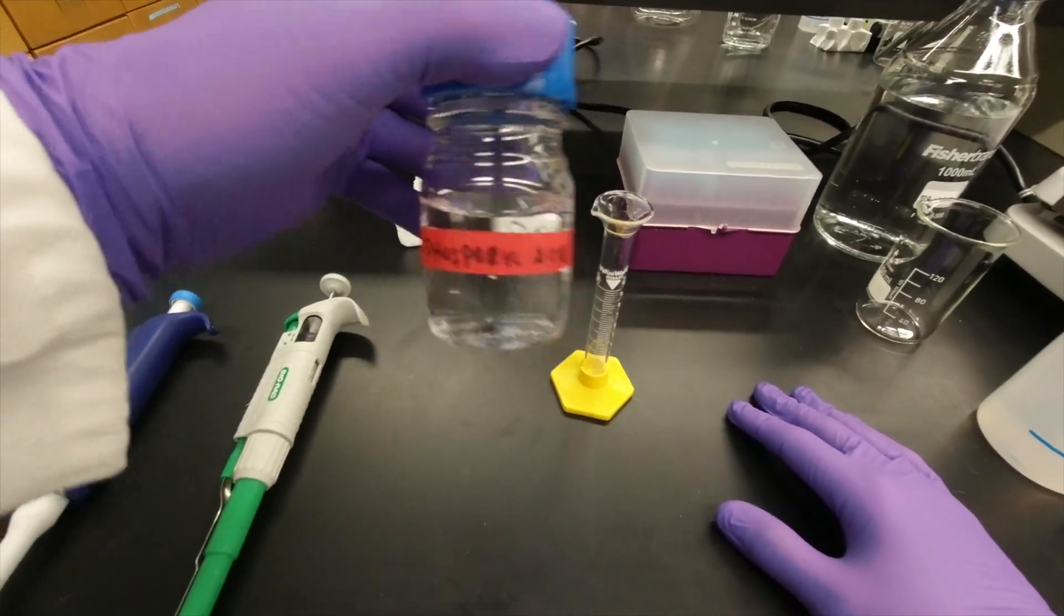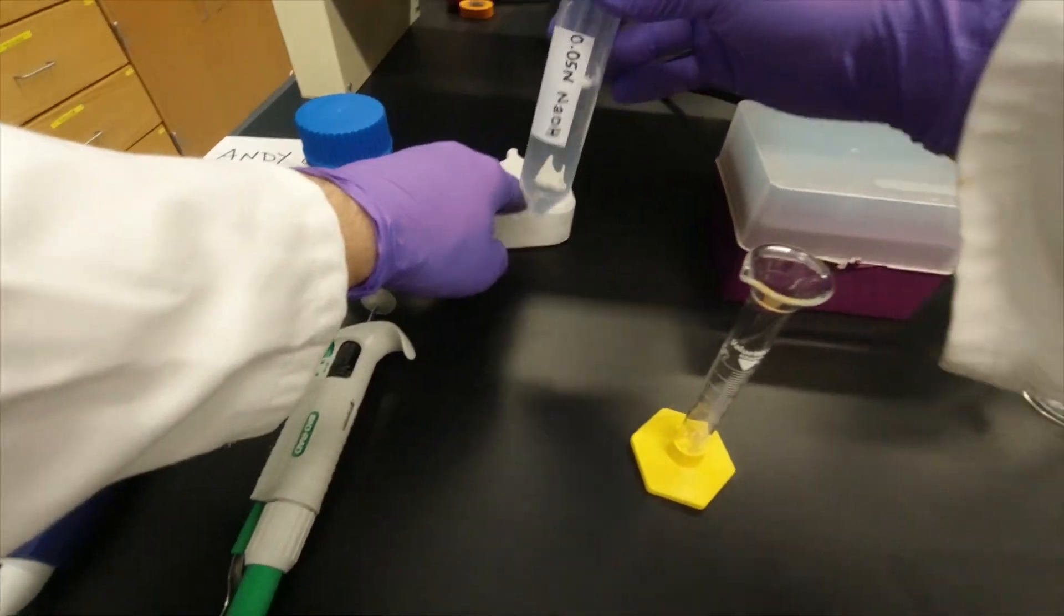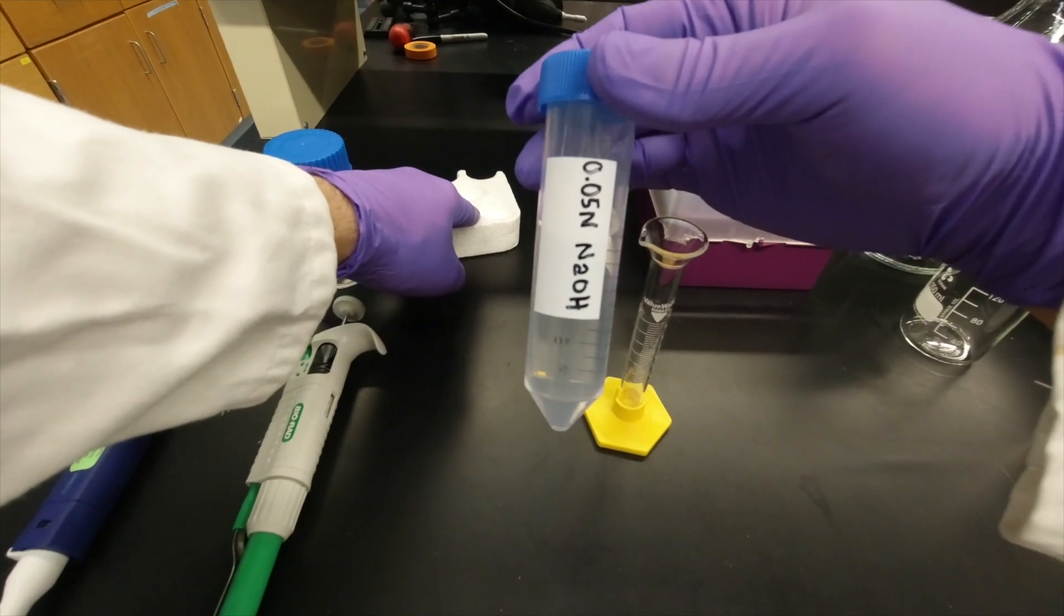Here we have our phosphoric acid, which we're going to titrate with our 0.05 normal sodium hydroxide.